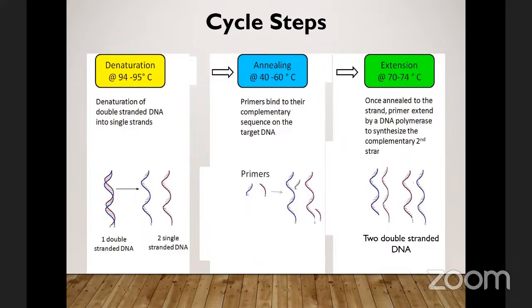This is just an example of what we just explained about what happens in the human body. But here we have the first stage as denaturation. Denaturation is when that double strand has to be separated. Remember, the double strand, in the double helical spiral according to Watson and Crick's description, has the coding region facing each other.